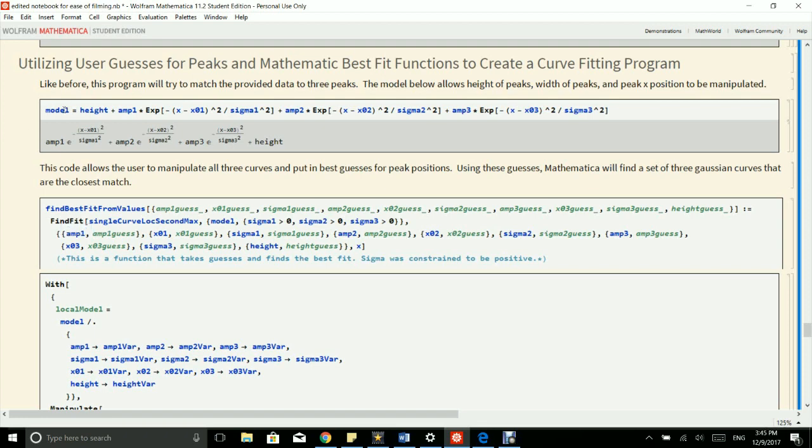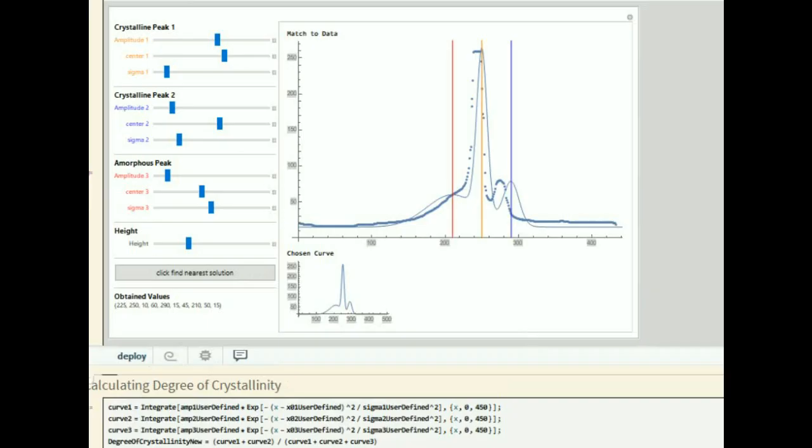So this model is a model that includes three different Gaussian peaks. So the full code is available to you in my notebook, but here's the final product. Like in the previous curve fitting program I showed you, you're able to adjust the positions and shapes of the crystalline peaks and the amorphous peaks as follows.